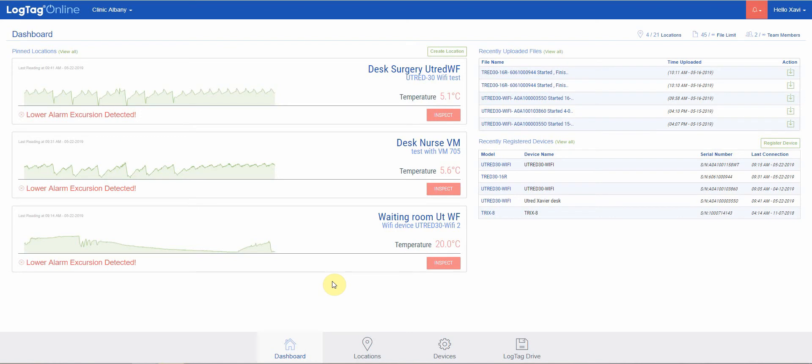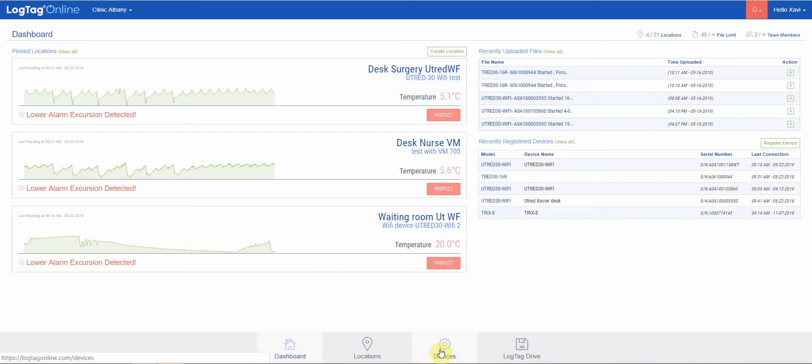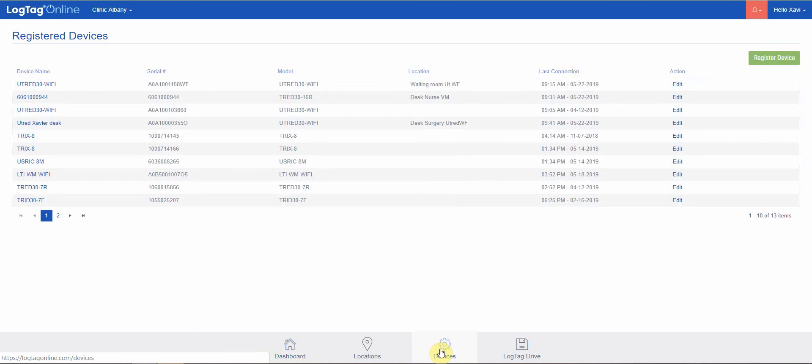Welcome to LogTag Online introduction videos. This video will be talking about devices. From the dashboard, we can reach our devices panel from the quick bar along the bottom.